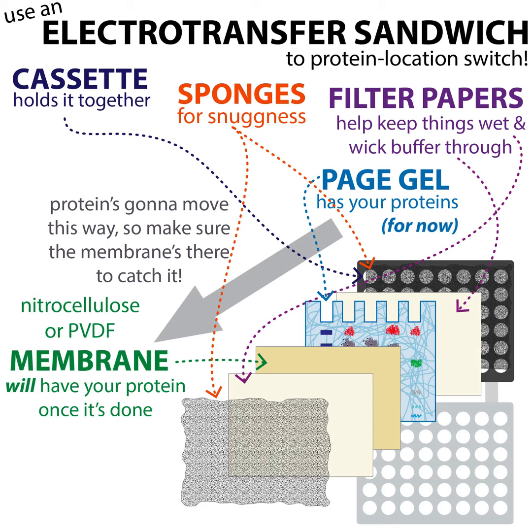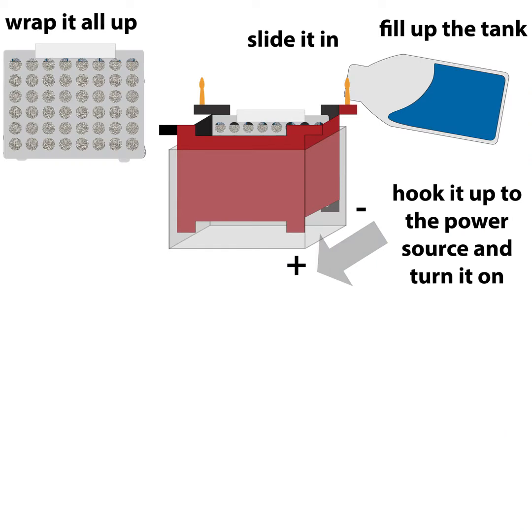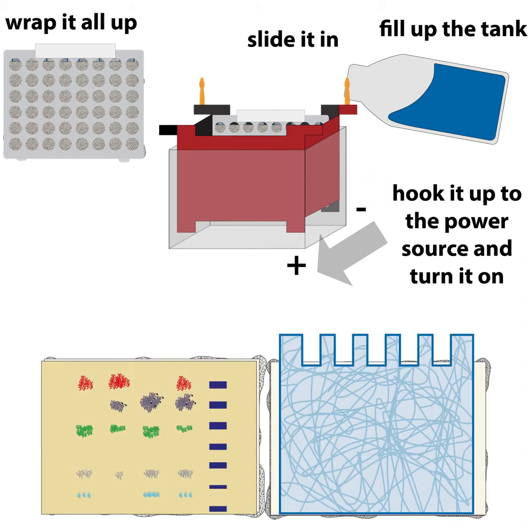But the most important thing is that you put your cassette into the module in the right direction. You want to make sure that you have the membrane in front of the gel in the way that the electricity moves in your module. So once you set it up, you're going to wrap it all up and slide it in, fill up the tank with your transfer buffer, and hook up the power.